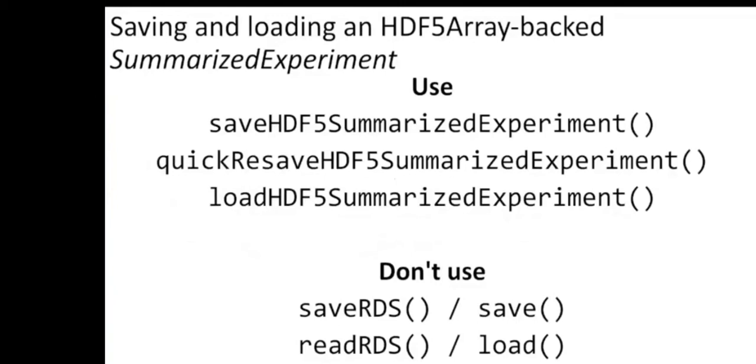This is because an HDF5Array-backed SummarizedExperiment contains files on disk that the saveRDS and save functions do not know how to serialize. saveHDF5SummarizedExperiment is specifically designed for this purpose. Similarly, to load the data back in, use loadHDF5SummarizedExperiment.